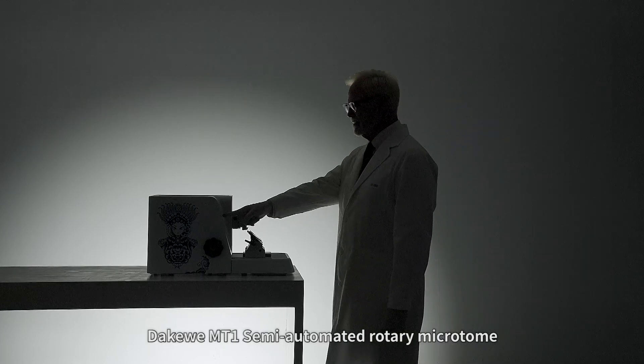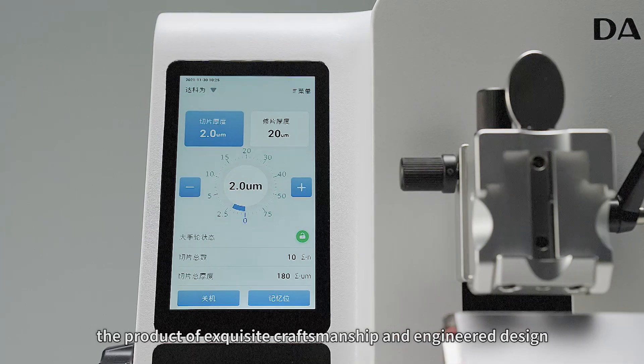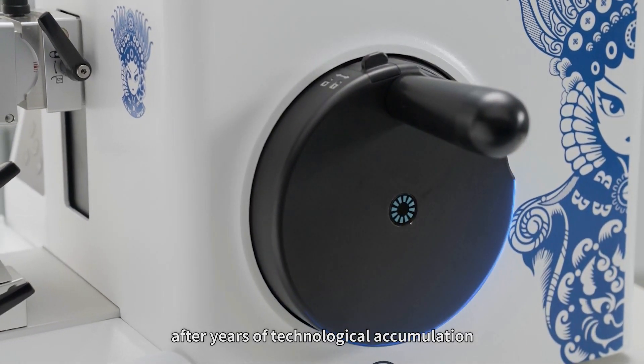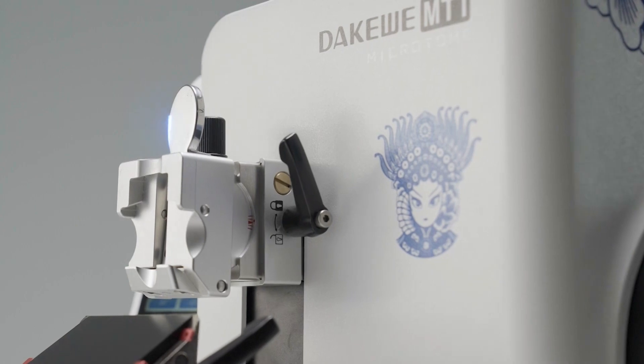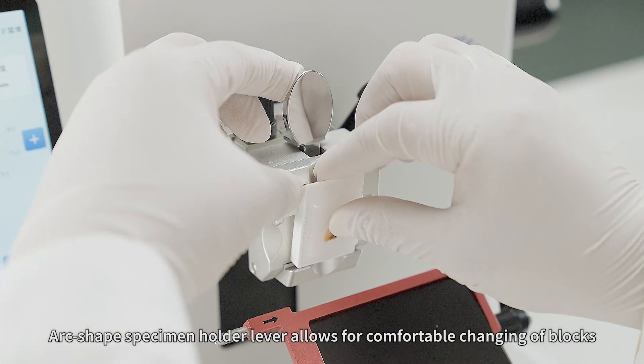Dakewe MT1 Semi-Automated Rotary Microtome — the product of exquisite craftsmanship and engineering design. After years of technological accumulation, a large top surface allows placement of utensils, and the arc-shaped specimen holder lever allows for comfortable changing of blocks.